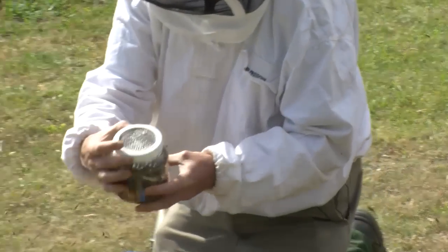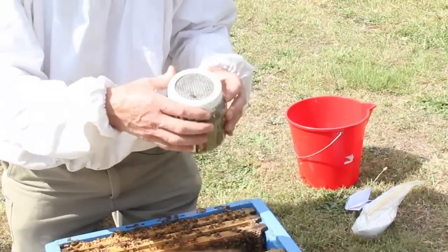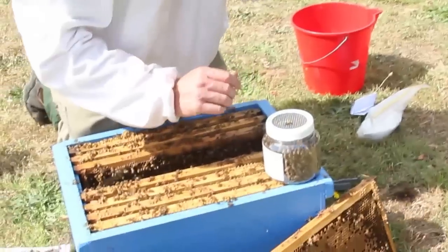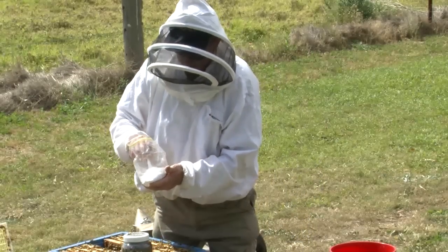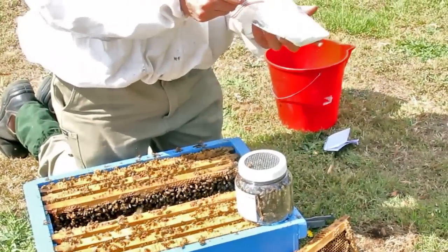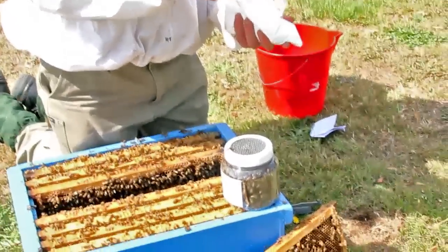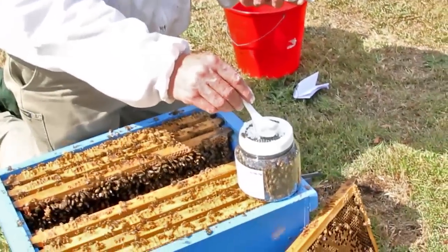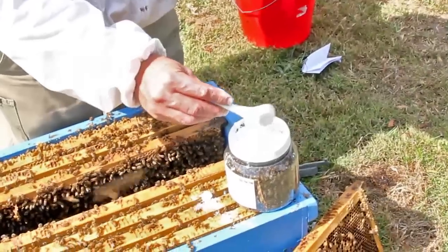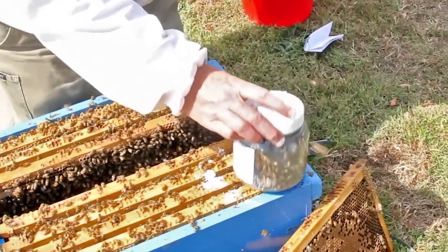Put the lid on — the lid has a grid or screen on it and the holes are at least three millimetres to allow the mites to fall through. We'll leave those bees there for a second. Now what I've got here is a white powder; it's just icing sugar. Icing sugar mixture is probably better because it doesn't clump up as much as pure icing sugar itself. So put a large spoonful of icing sugar on top and just tap it down.